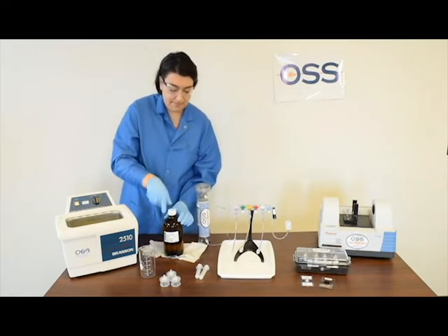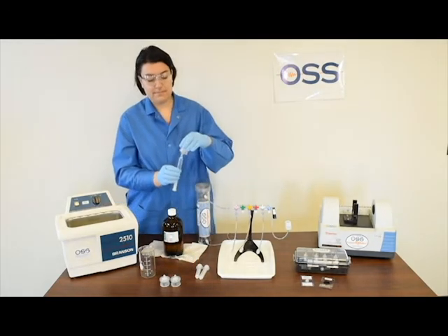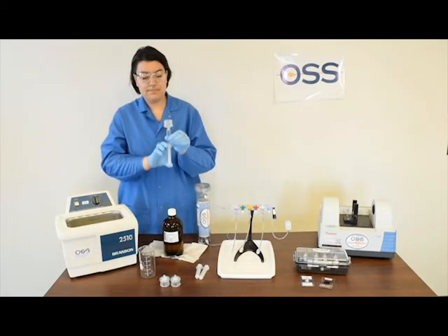The patented OSS ClearShot extractor is attached to the syringe and 10 milliliters of volume flows through the infrared amenable oil and grease extractor.